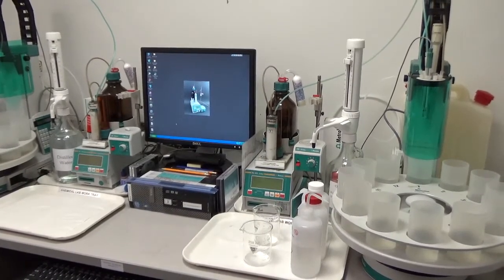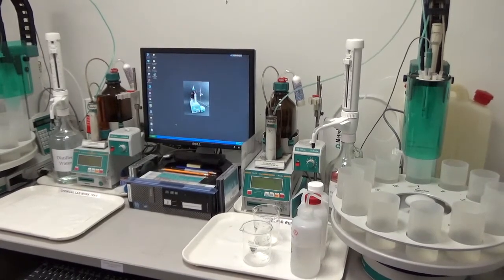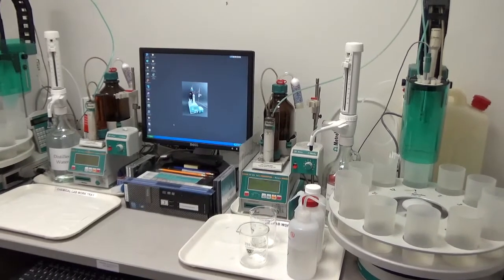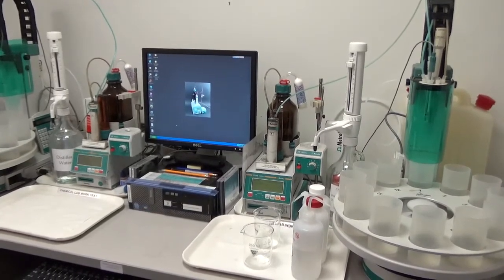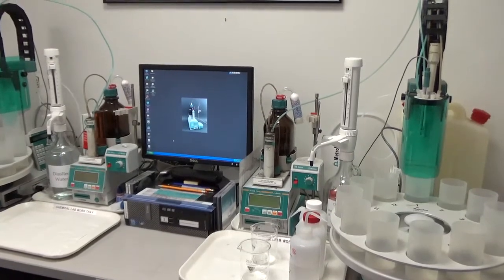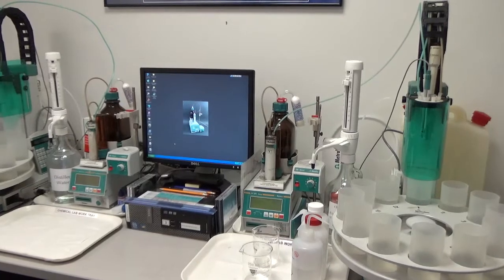When we do acid-soluble chloride, we digest 10 grams of pulverized concrete sample in diluted nitric acid — 1 plus 7 nitric acid. We digest the concrete powder in the nitric acid and then do the filtration. We take the filtrate and analyze it for chloride using silver nitrate as the titrant.